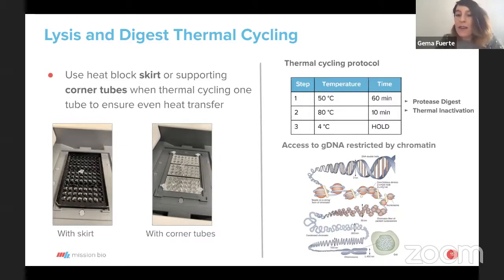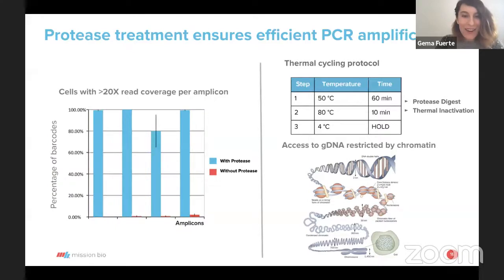And you can see here the picture of exactly all the proteins that we are getting rid of. So if people wonder why the protease treatment is important, I always love to show this graph over here.